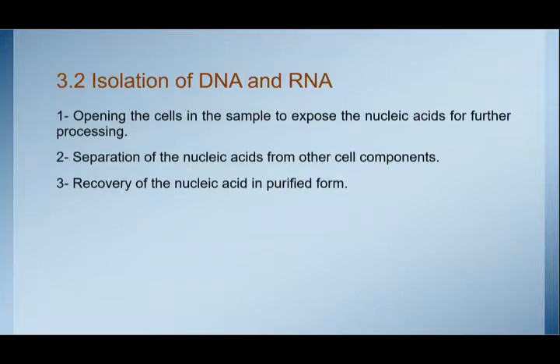There are three basic requirements. 1. Opening the cells in the sample to expose the nucleic acids for further processing. 2. Separation of the nucleic acids from other cell components. And 3. Recovery of the nucleic acid in purified form.